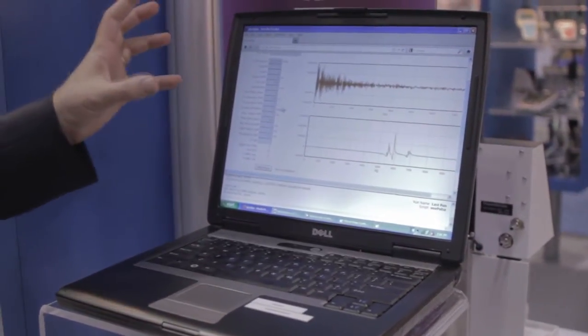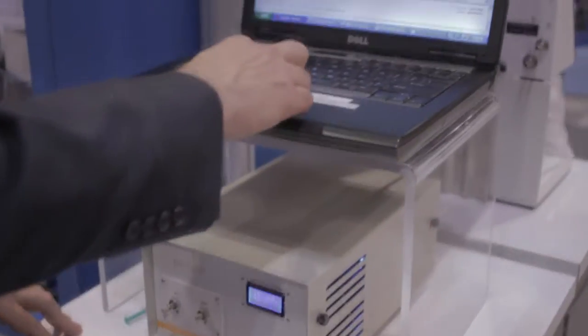This display is just a preview of the data. So the machine runs for a little while and you get a preview through your web browser. And then as soon as you've collected the data you can download it from the machine.